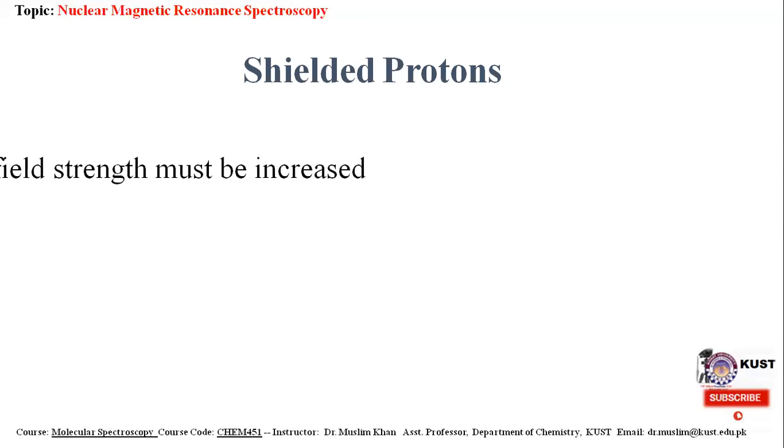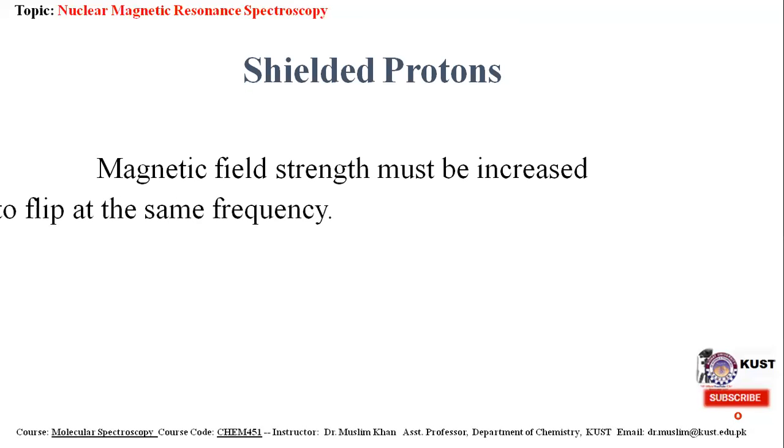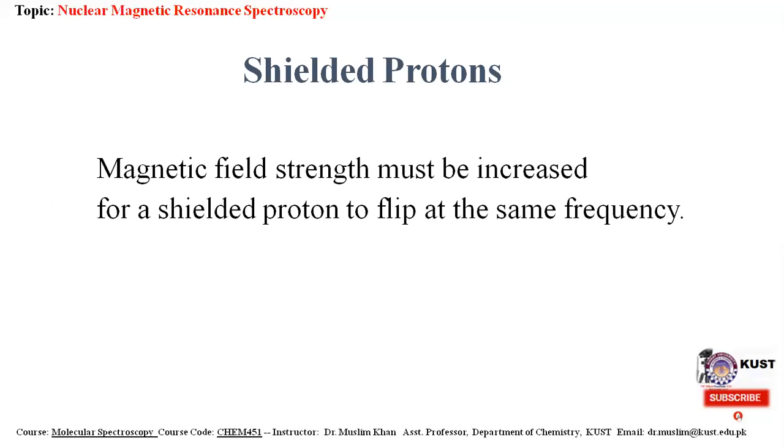So for shielded protons, the magnetic field strength must be increased for a shielded proton to flip at the same frequency.